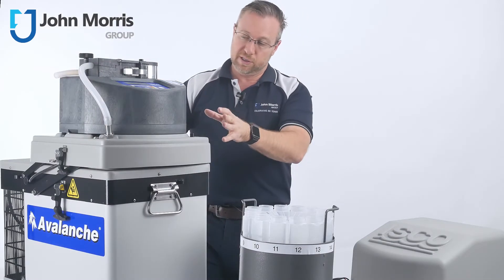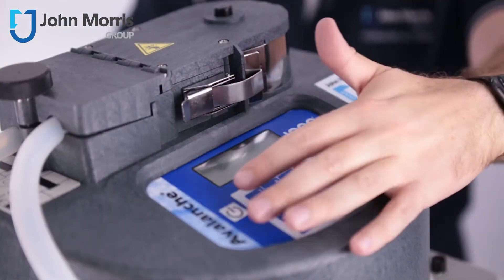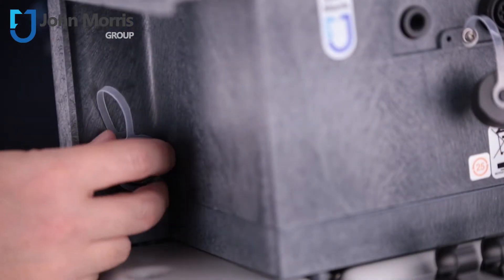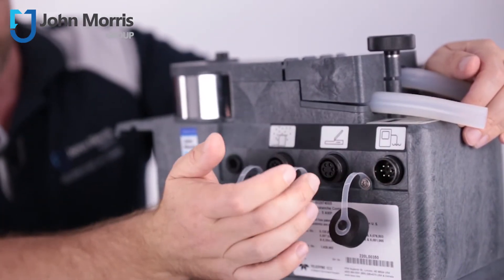This unit features the 6712 head. The 6712 head is a very versatile head unit, and what we really love about it is that you can plug a flow meter directly into the side here — a 700 series flow meter — or on the back you have a number of different options. You can plug in your own external flow meter from a different brand.